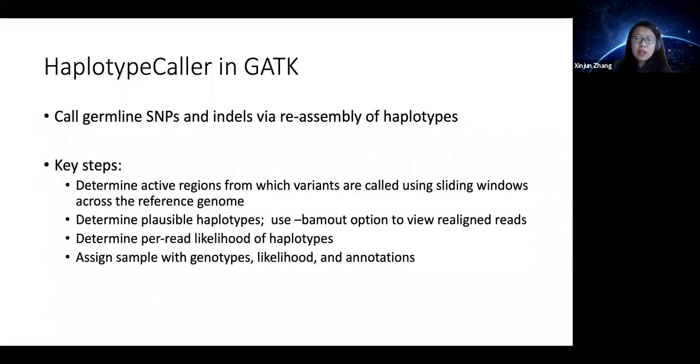All right, the function we're going to use in GATK to do this magic step is a program called HaplotypeCaller. This is the most essential part of our GATK variant calling. What it does is look at your BAM file, identify regions where there are variants, and call them. It will call both SNPs and indels at the same time.